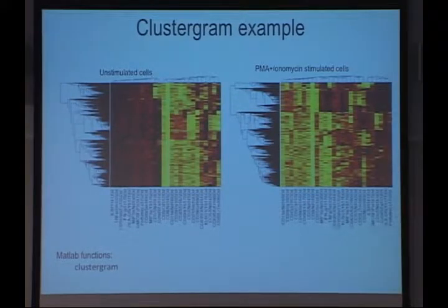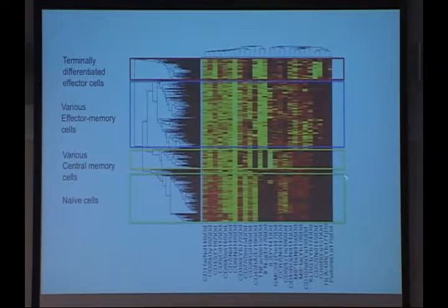And then you see different clusters of cells that represent cells that express similar amounts of each of these things. So it's sort of like a hierarchical clustergram that you have with SPADE, except it's not as sophisticated in terms of how it's created, and then you see all the information for each cluster of cells as you go down here. And after stimulation, you can see that a lot more things light up, and then you can see how things kind of cluster. And you can try to interpret what they mean and how homogeneous different subsets are. So for instance, you can look at these markers and figure out that these probably represent naive cells here because they're not making as many cytokines and they express CD45RA and CD27 and things like that.